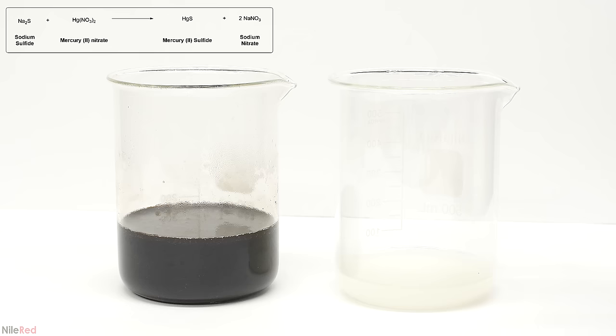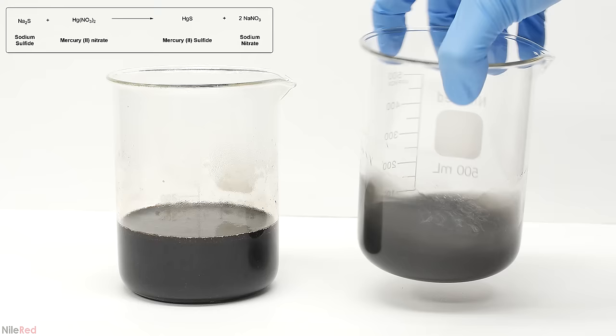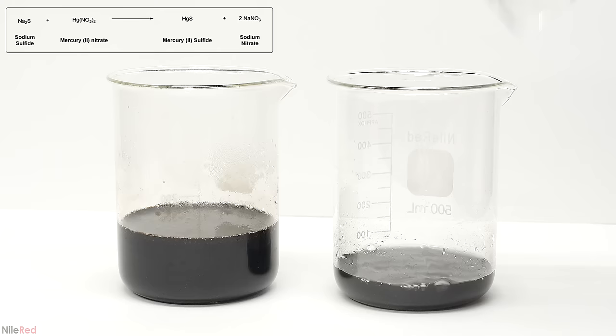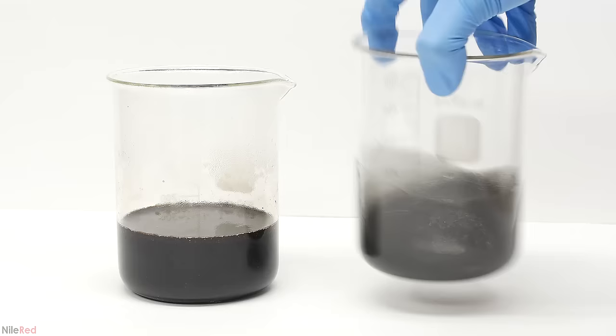I then went back to the other solution and added sodium sulfide. When the sodium sulfide is added, it will react with mercury ions and precipitate mercury sulfide. The mercury sulfide will separate out because it's almost completely insoluble in water. This step should also precipitate the other metal ions as their corresponding sulfides. After swirling it around a little bit, I let them stand for a couple hours.